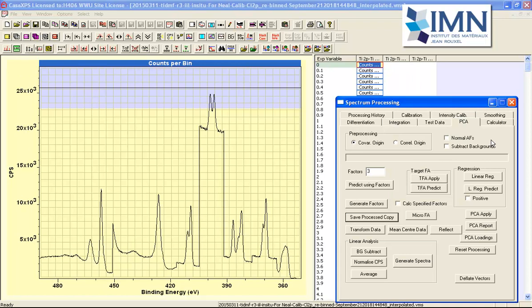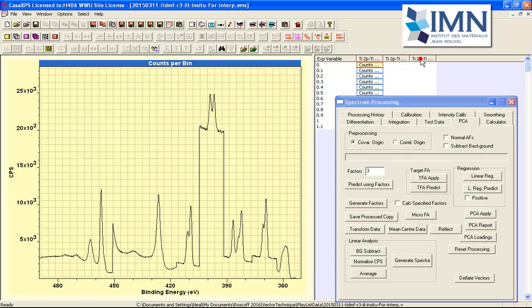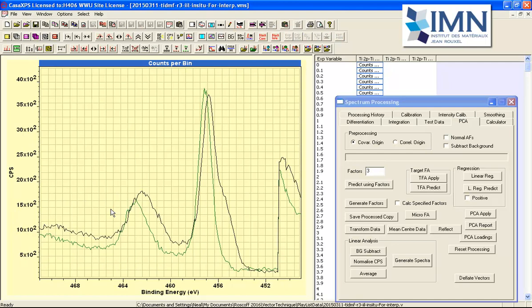So the outcome of merging VAMAS blocks and then doing a difference analysis are a pair of spectra that give you a different perspective of the data set other than the one that was originally presented by the measured data.